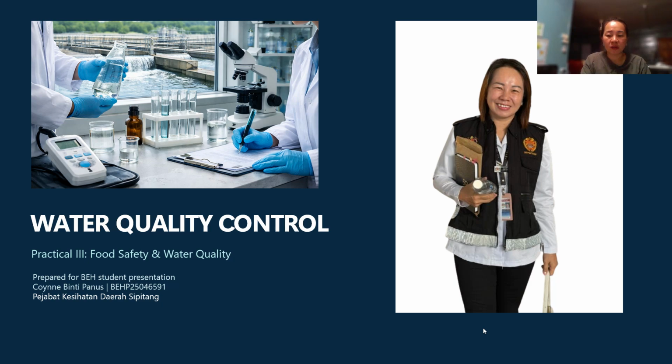In this presentation, I will explain the importance of water quality control, sampling procedure, microbiological and chemical sampling, equipment calibration, documentation, quality assurance, and reporting.